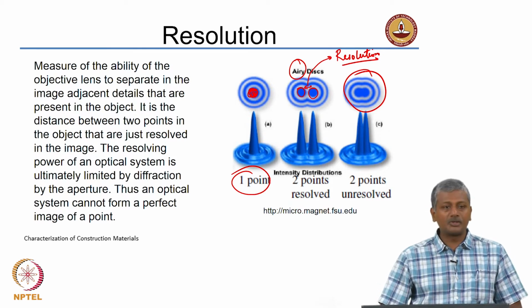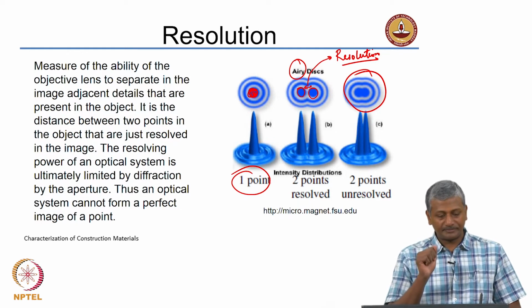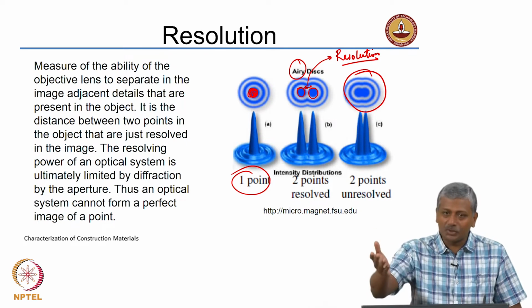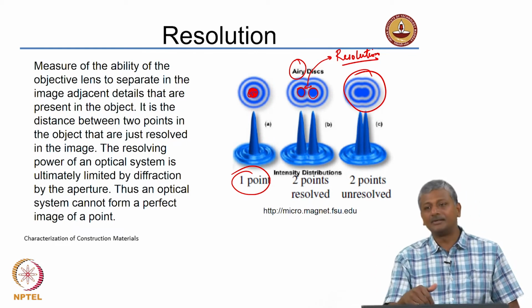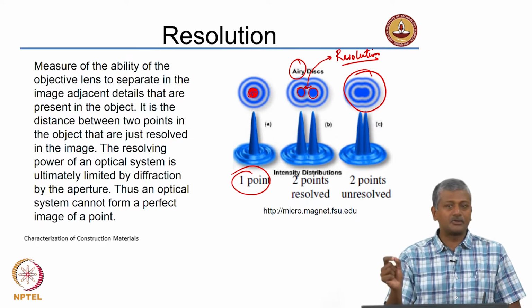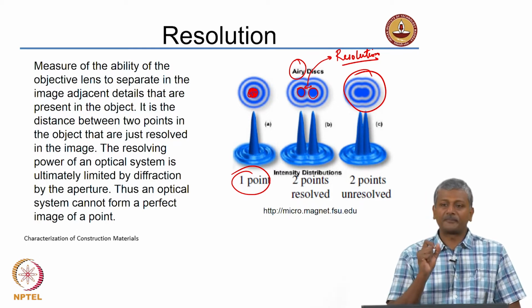Okay. So, resolution is the ability to resolve 2 points in an image which are lying next to each other. So, what is a good image, one which has a smaller resolution or a higher resolution? Obviously higher resolution, but what does it mean in terms of the distance? Smaller distance between points. A higher resolution implies that your image is able to distinguish between points that are located very close by.